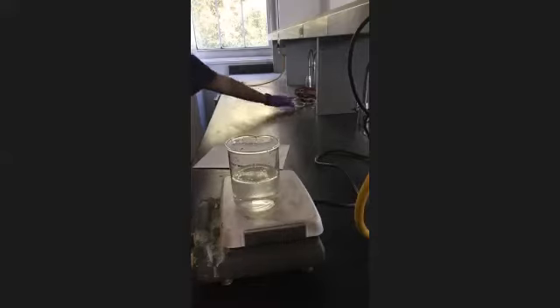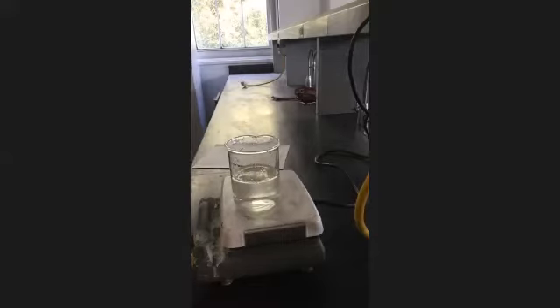What heat do you have? I would put it on about 5. You want this water to be boiling. If we're doing a recrystallization, which we're not doing next week, we're gonna take a gap and have another lab the following week, because I have an overlapping lab on Wednesday, so we can't meet again next week. But if you were doing a recrystallization, you would not want your stuff boiling, but this you want boiling.